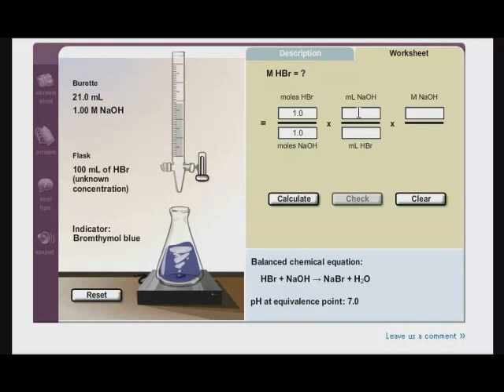Now I'm going to come over to my data. Well, how many milliliters of sodium hydroxide did I use? I used 21 milliliters. Now how many milliliters did I have in my flask of HBr? I had 100 milliliters. And what was my concentration of my sodium hydroxide? It was 1.00 moles per liter.